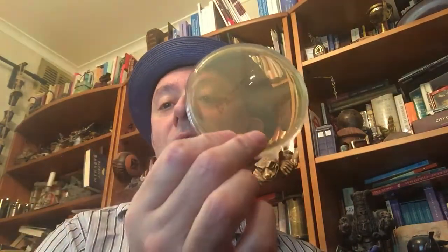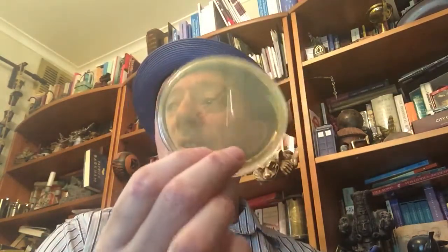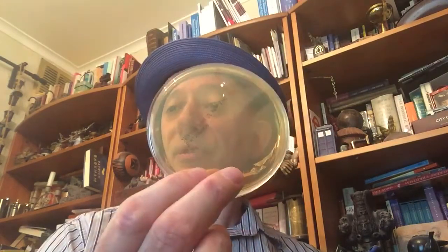The main source of these growth factors comes from tryptone, which is derived from cows. This link to animal byproducts means that most commercial culture media companies arose using the side products of the food industry, specifically making meat products, as a way of utilising the leftover substances.